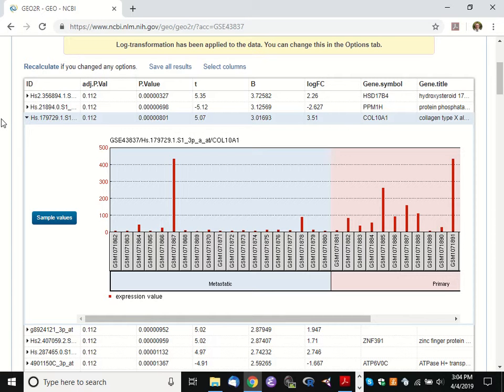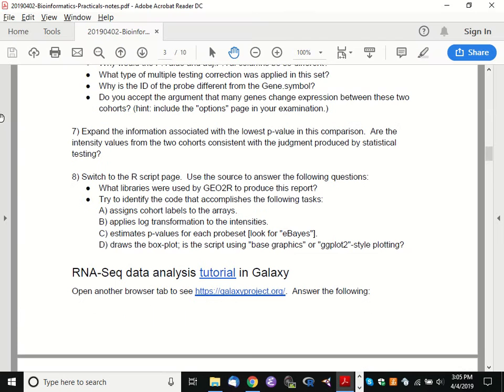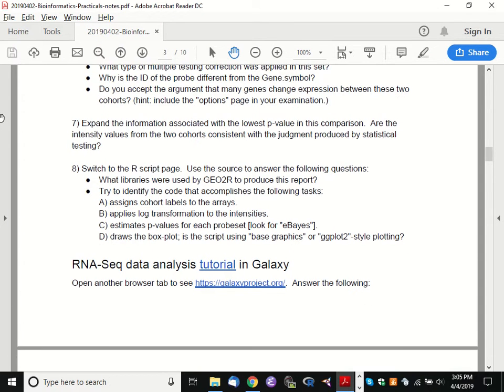But in this case, we are looking at the values that were recorded for this probe for all of these different samples. We have a total of 38 samples. We're going to get all 38 measurements for this particular probe. That's pretty impressive, what I would call drill down, the ability to start from a summary table and work all your way back to the original data that we started with. Grand.